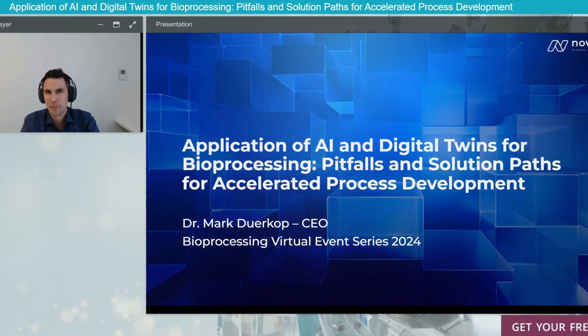My name is Duerkop. I'm the co-founder and CEO of Novasign. We're a spin-off focusing on bioprocess modeling. Today, we're going to talk about process modeling and the application of artificial intelligence and digital twins for accelerating bioprocess development. So actually, artificial intelligence is everywhere today. You hear it everywhere from the media, and it's quite clear that this will also migrate to bioprocessing.